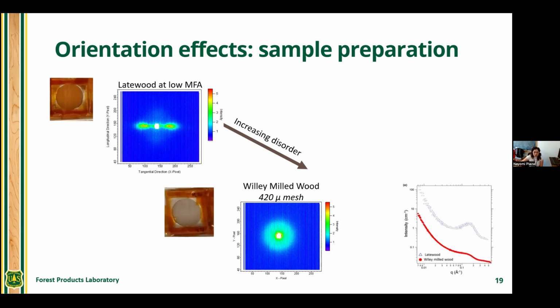To make sure that none of this potentially dispersible material would be dispersed after being exposed to neutrons, and you don't get into any kind of trouble with radiological folks, we make sure to put it inside this aluminum mesh, which is what you see here, and pack it inside there really finely. That worked really well. We were able to get scattering from those sections.